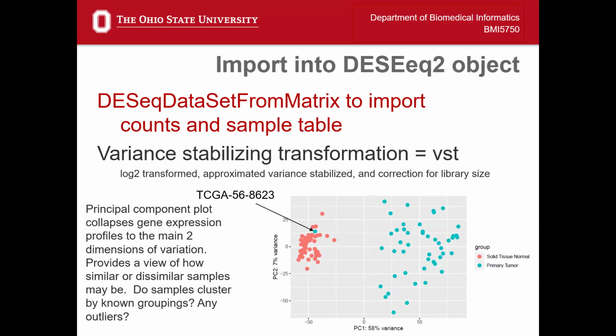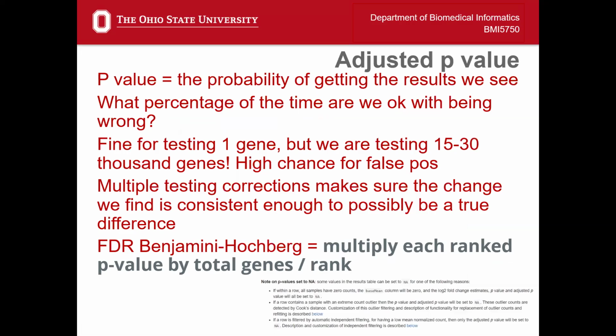The catchphrase for the James Cancer Center is no two cancers are alike, or every cancer is unique. I should always look this up because I can never remember it. But there's a catchphrase for the James Cancer Center that we are demonstrating right here, that all of the tumor samples have a lot of differences. If we compare this spread of tumors versus this spread of normal samples, we can see that. Okay, so that's the first thing we can look at with our data.